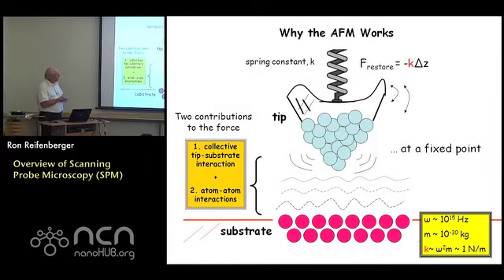As your tip gets closer to the substrate, the force between the lead atom on the tip and the closest two or three atoms on the substrate starts to dominate the interaction. So it's always a delicate combination of these two forces that determines the net force that the tip feels. Now, what is the tip going to do in response to these forces?